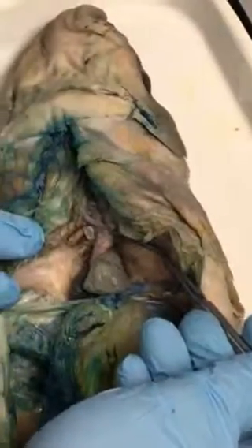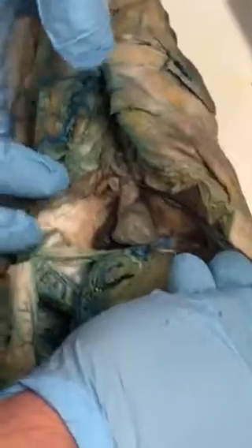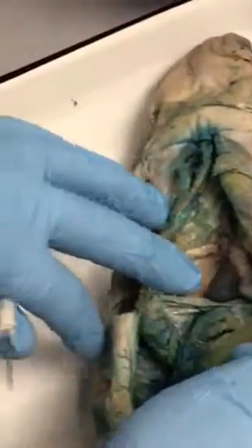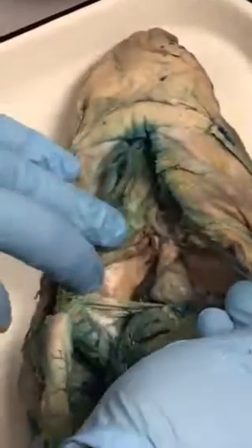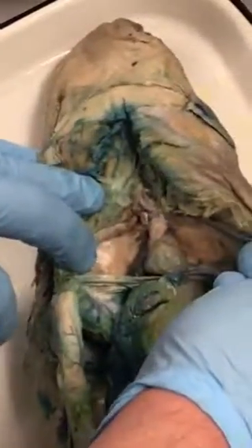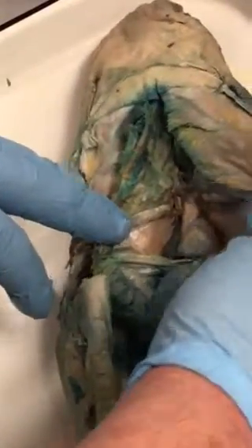Wait, so those are the afferent because they're coming away? Yeah, goes into the gills. So you said the ventral aorta is afferent and these are efferent? The afferent go into the gills, and the efferent go away. This conus arteriosus is pretty much the aorta, and it immediately turns into the ventral aorta, which almost immediately splits off into these little guys, which go to the gills.